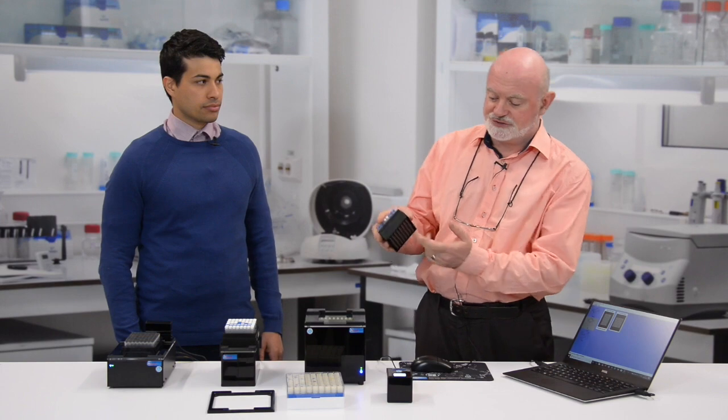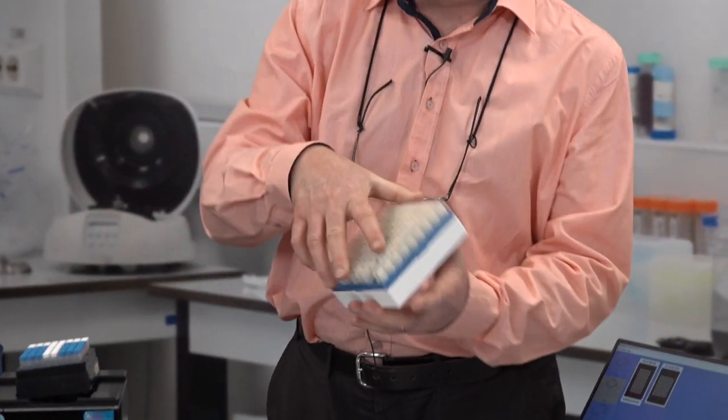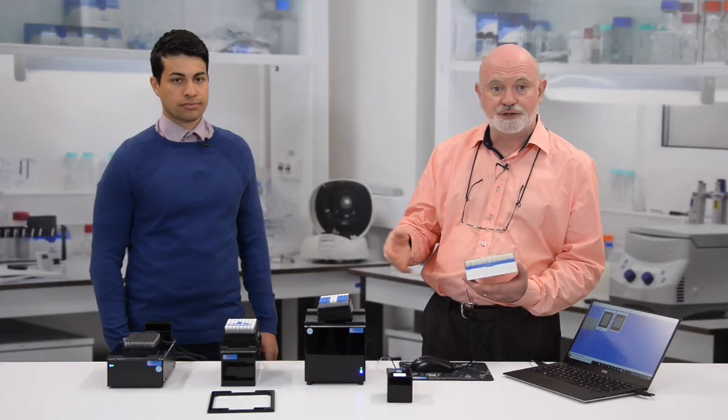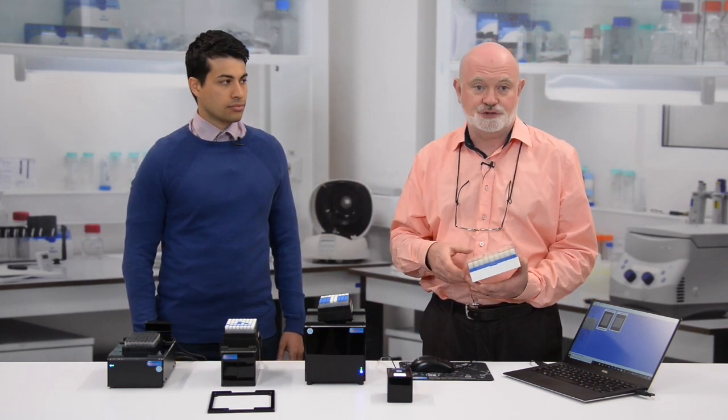The range is the widest available on the market, and they all use CMOS-based camera technology to give you quick and accurate decoding of data matrix 2D barcodes. These tubes can be in SBS racks, which are used for sample storage, or they can be in cryo racks, which are used for deep storage in cold facilities for other biological samples. Our scanners can read them all, and Avash is going to help me demonstrate that.